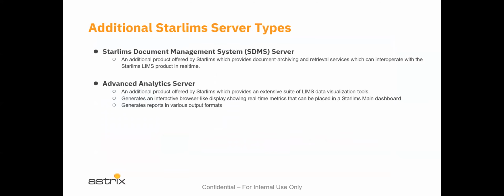So a brief introduction, we're not going to go over them in this training, but you'll see quite a bit of reference to the STARLIMS document management system, otherwise known as an SDMS system. And it has its own server, and it is configured, and there's training related to that functionality altogether. But at a high level, anytime that a STARLIMS workflow is in process, as these samples come in and as the results are applied, generally there are reports that are generated that must be associated with those samples for the life cycle of those samples.